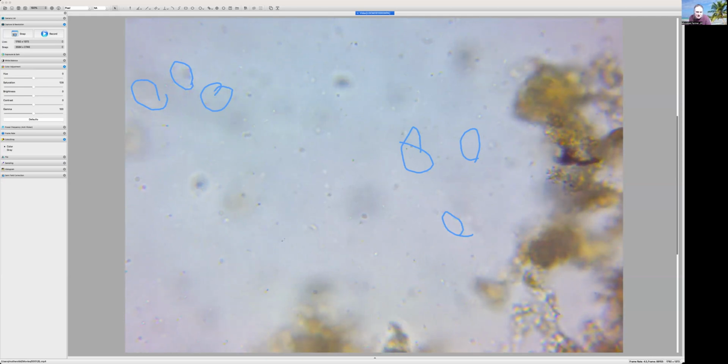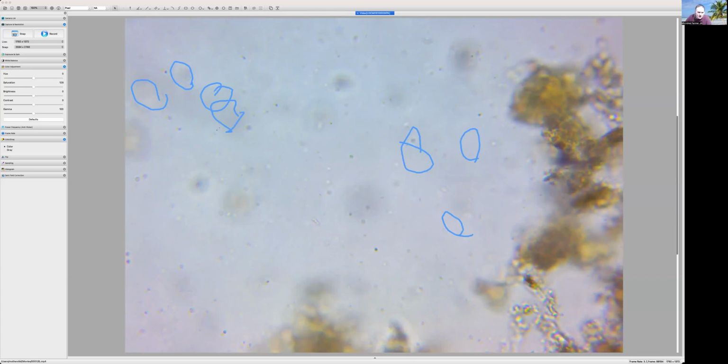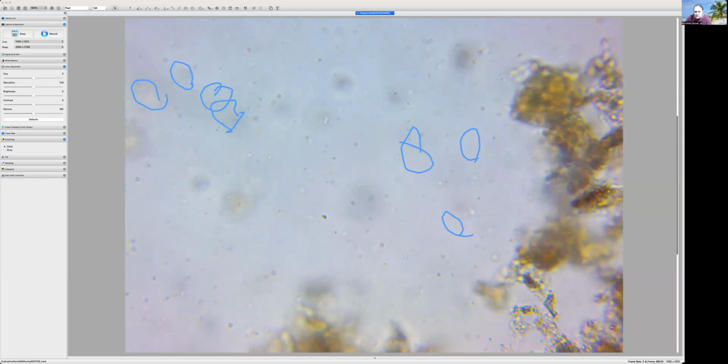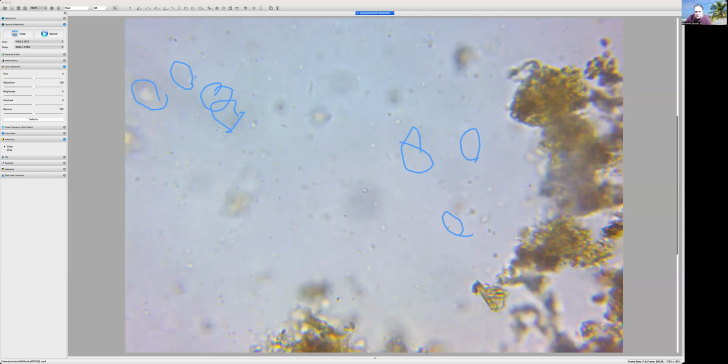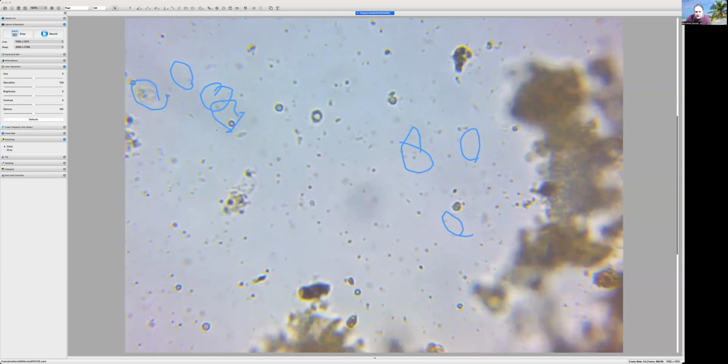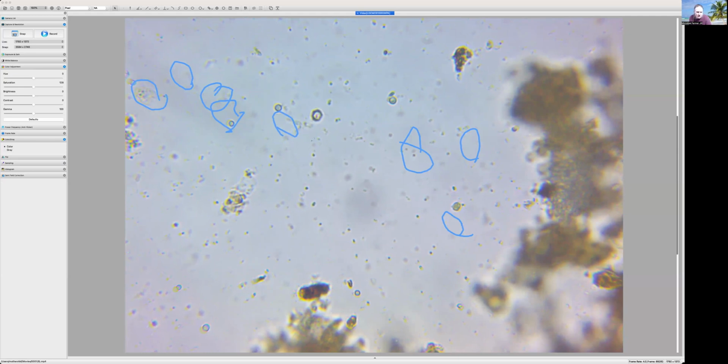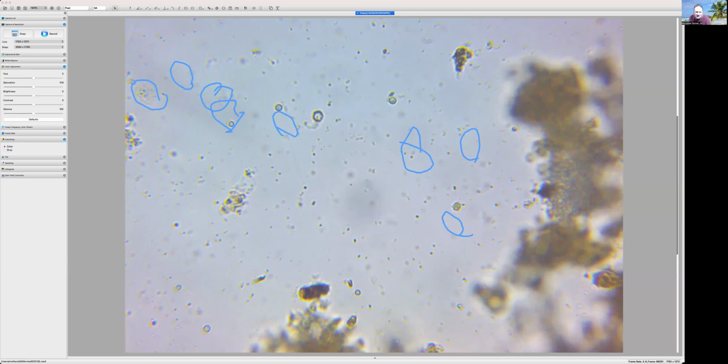Now, I'm seeing this guy moving here. See that back and forth. I would like to really try to focus in on him, but once again, we are extremely loaded. It needs to be diluted down to be able to really see well. There goes some flagellates. Mostly what I see is flagellates. They've moved now, but definitely here, he's pulling himself around by that long stalk sitting out here. I don't think he's a stalked ciliate. He's a flagellate.